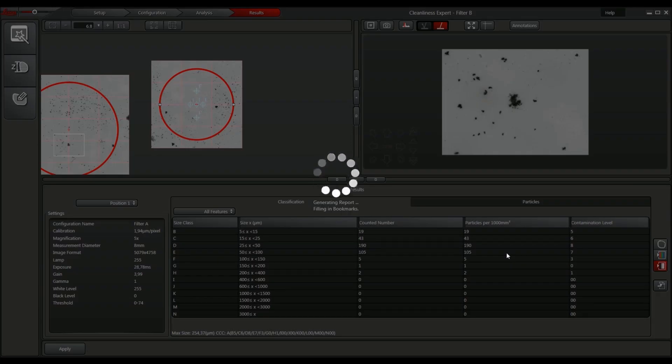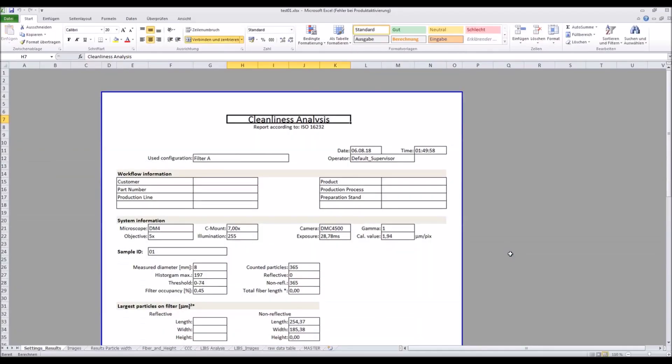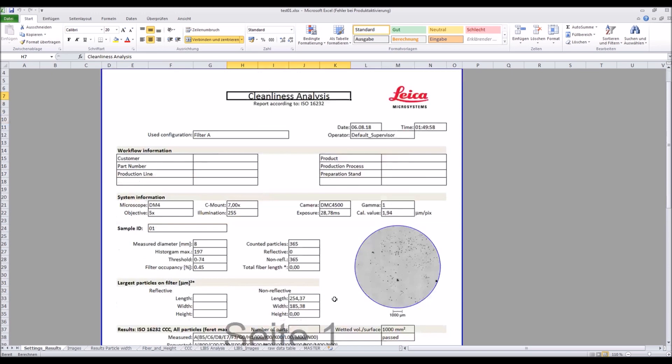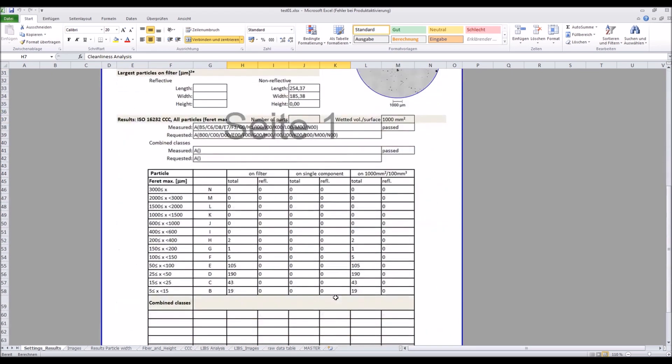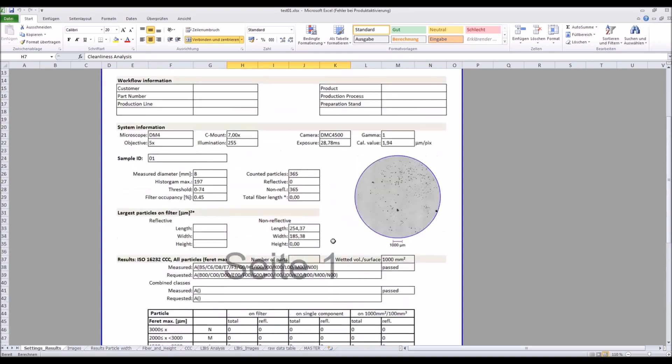The reports are automatically generated as Excel, PDF, or CSV files. All relevant information about the system and analysis are in the report, including image and measurement results like particle dimensions.